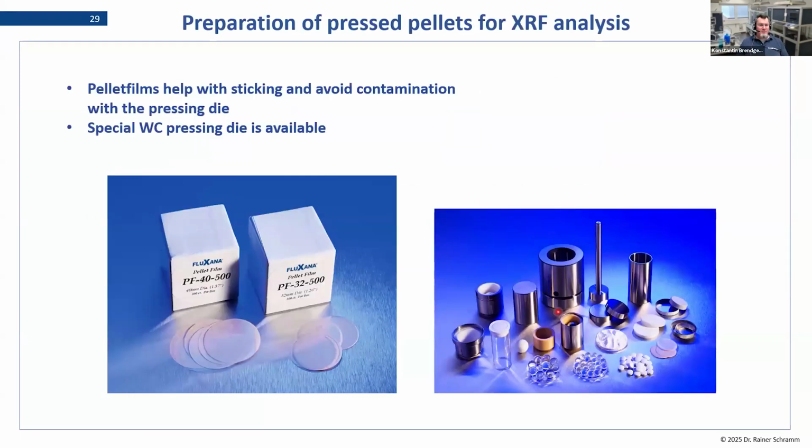Speaking about the pellet films, what are those? These are basically little pre-cuts that fit the diameter of your pressing die.